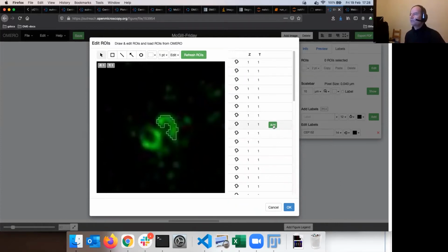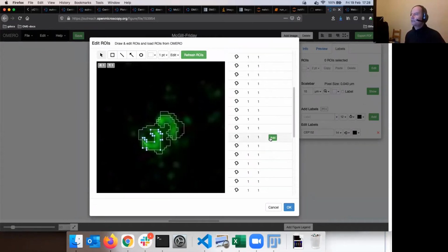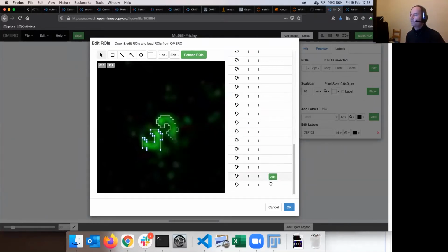Okay, for example, I like this ROI. Okay, and I like that ROI as well. And very good. If I select a couple more, yeah, this one, why not? So these ROIs are coming from Fiji ultimately. You know how it happened.